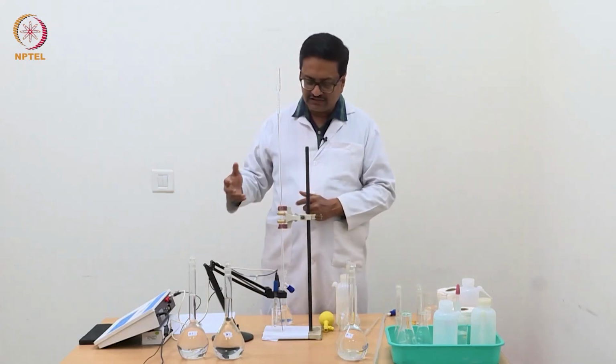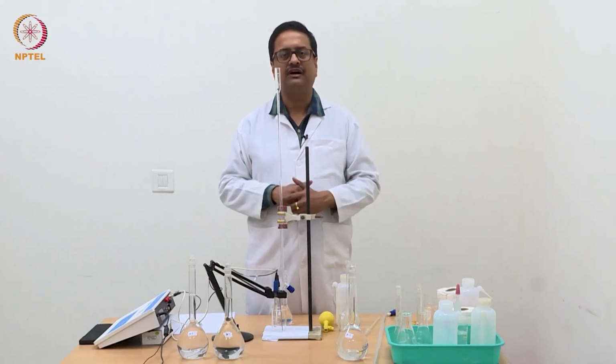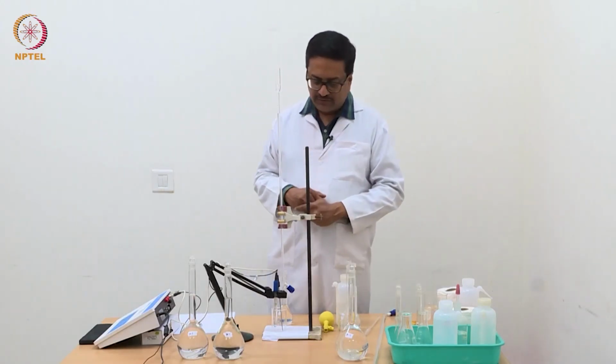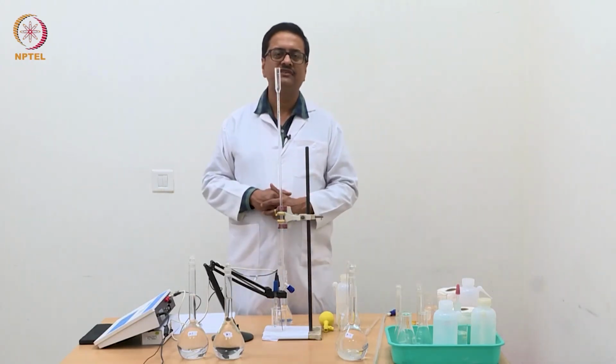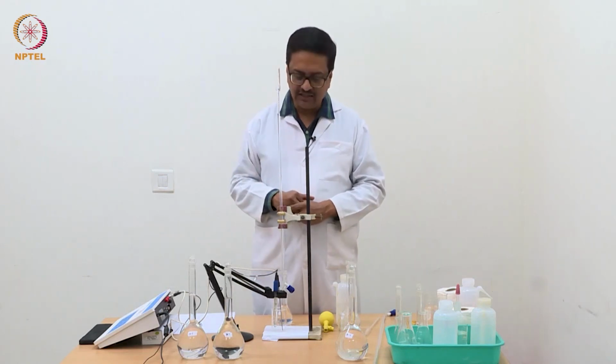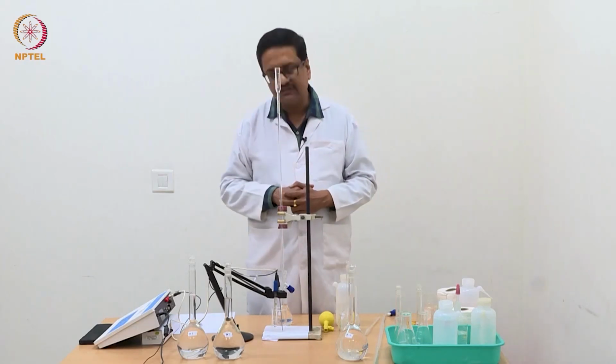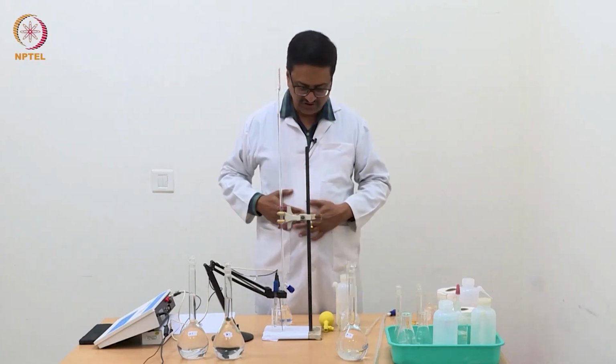So while doing a titration, as you know, we are using NaOH, so the number of H plus ions is reducing. Simultaneously, if the volume of the solution continuously increases, then there will be an error in measurement of pH. That is why we use a 10 times concentrated solution.